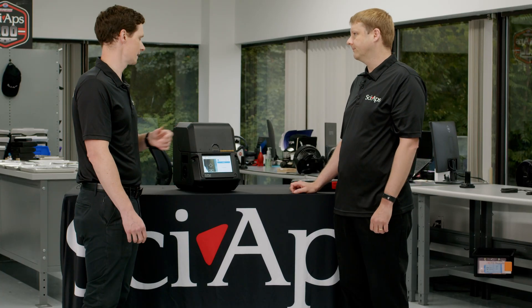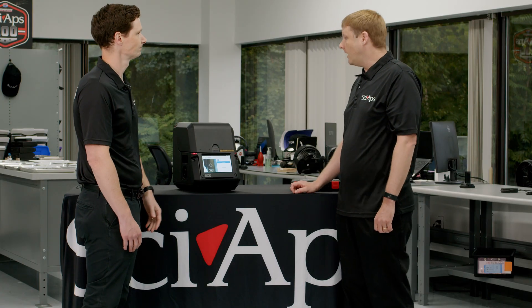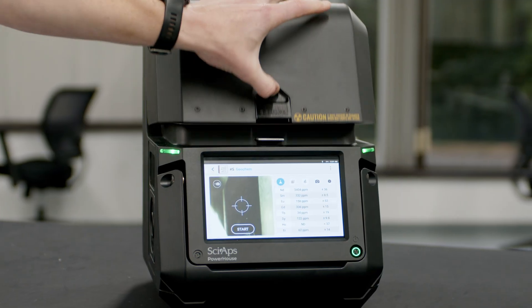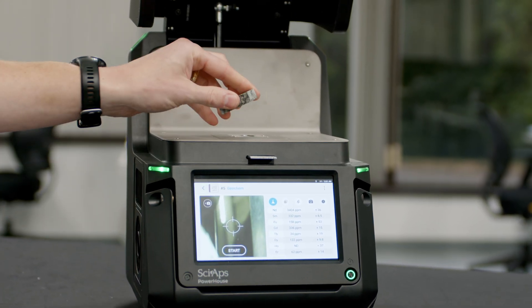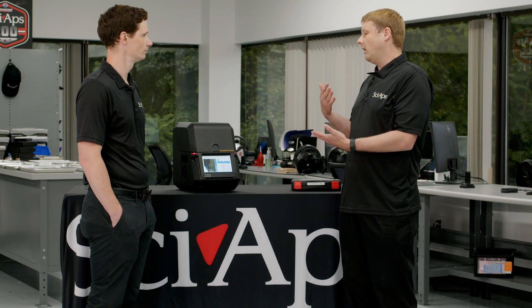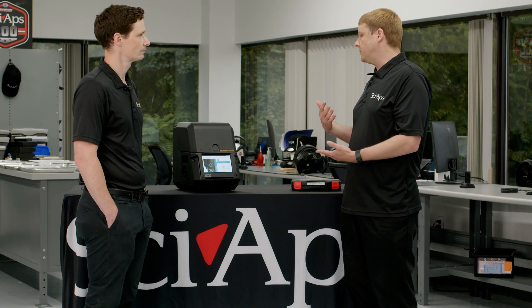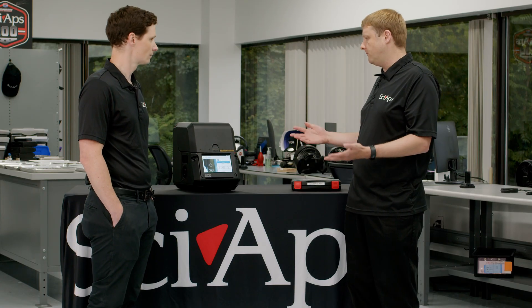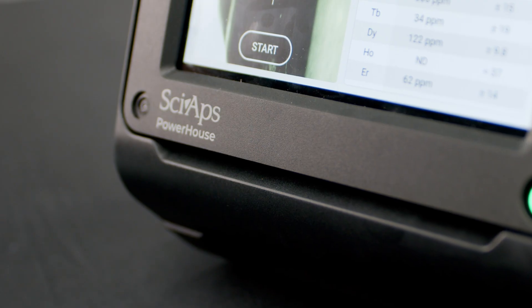So Brendan, while that's running, could you maybe tell us a little bit about what makes this special? Yeah, so it's our new tabletop analyzer. The Powerhouse runs at up to 80 kilovolts, and 80 kilovolt X-rays are really important for testing rare earths — the heavier elements that are difficult to test with a handheld. We actually have a big range of elements calibrated on this, up to about 48 or so across the whole periodic table, but it's really specialized for the rare earth elements.